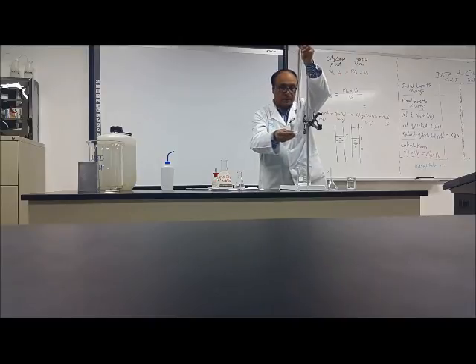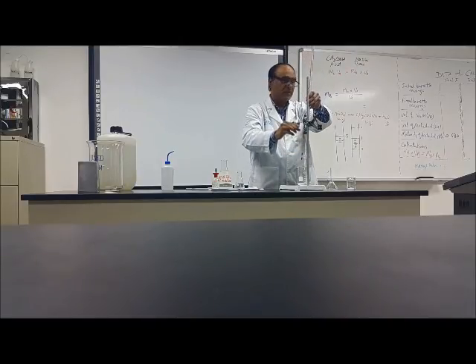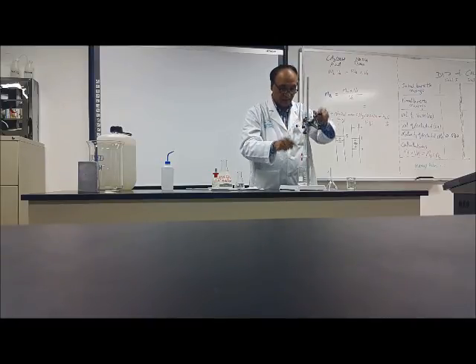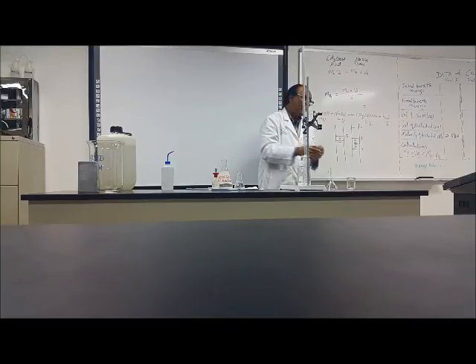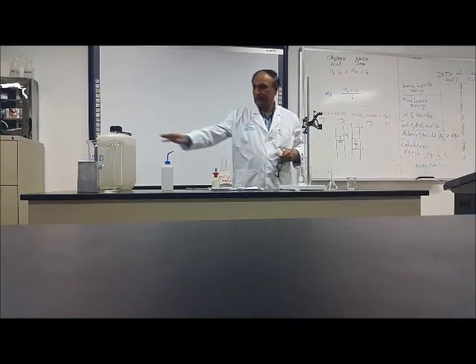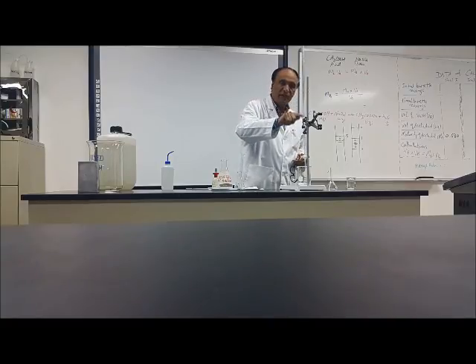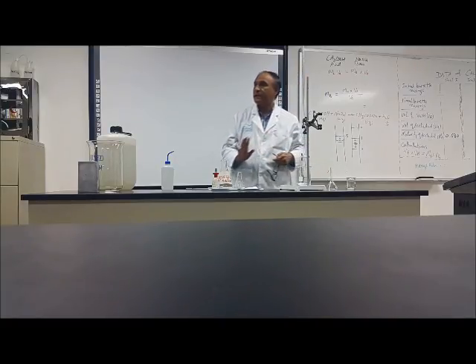And then I will open it from here. This is for cleaning, final cleaning. This is called rinsing. The final cleaning is called rinsing. So you see that. Now if there is any drop, what is that? Sodium hydroxide, this one, right? The solution. So now if there is any drop, we should not worry, it is the sodium hydroxide.